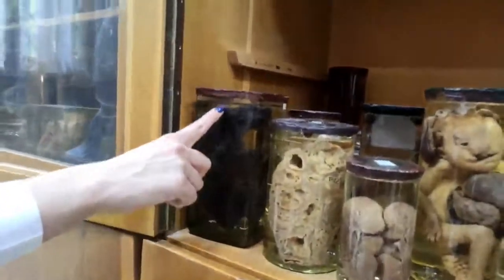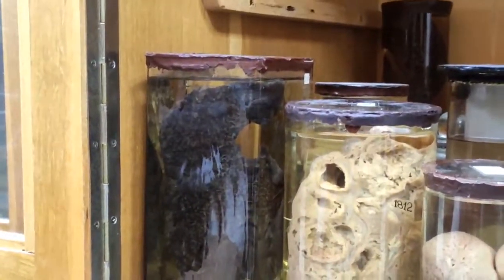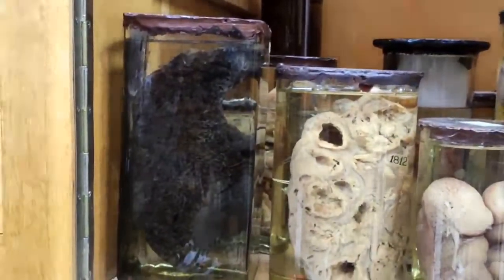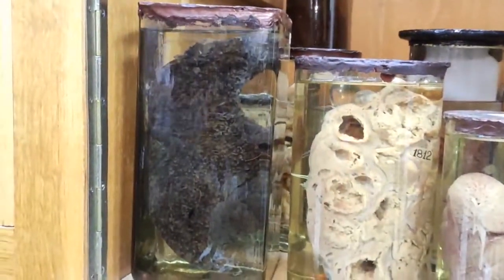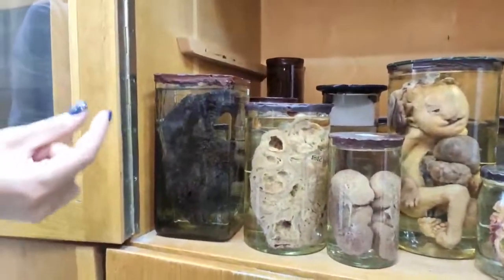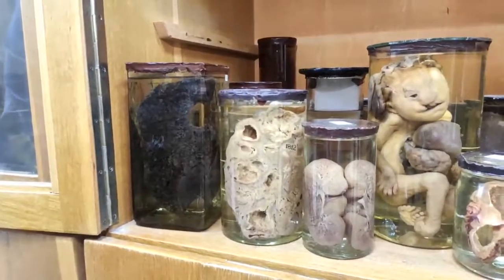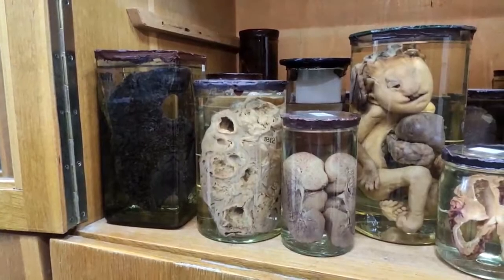Okay, the next one is miliary tuberculosis, and you can see that the whole lung is infiltrated by these small nodules of white color because they contain caseous necrosis, and they are very multiple, and they are just a few millimeters in diameter. That is why we call them miliary. You should always know how tuberculosis granuloma is organized.